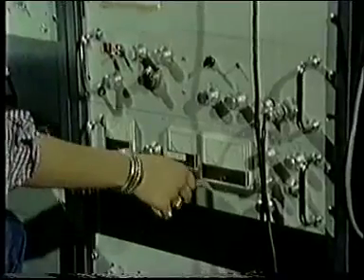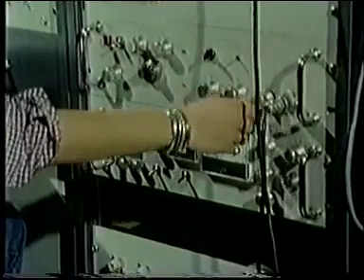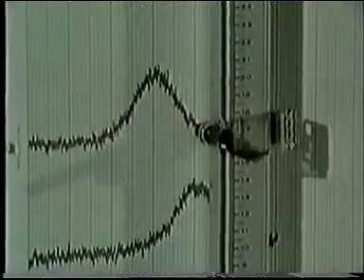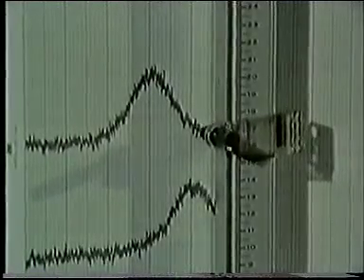Now, the reason why we performed this experiment at the very low temperature of 100 degrees Kelvin was to create conditions where molecular nitrogen is likely to be adsorbed. So it's probable that this peak is due to adsorbed dinitrogen. But what happens when the temperature is increased? Well, some dinitrogen is desorbed, but that's not all. The peaks moved.